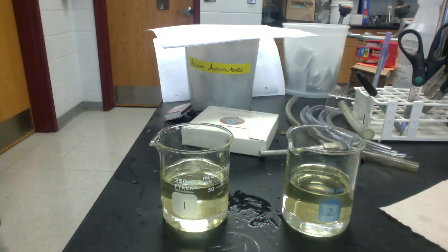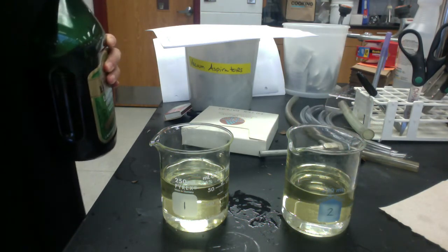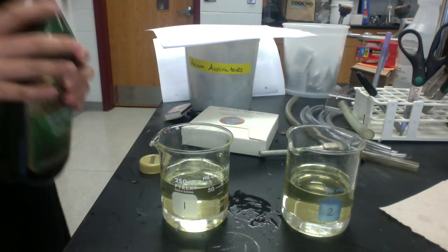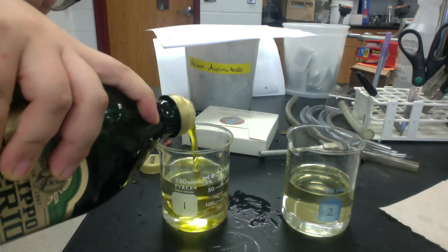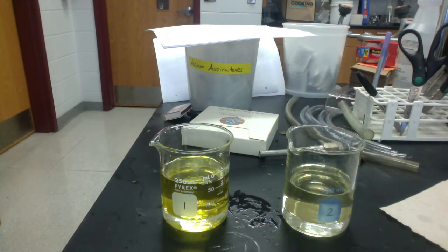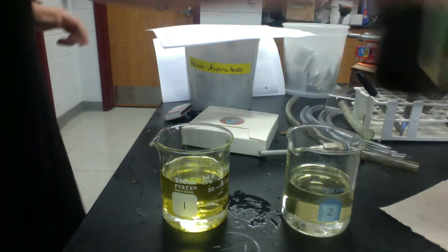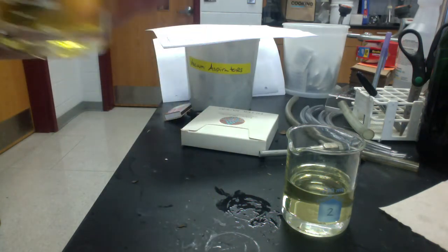Add a small amount of olive oil to beaker 1. So now it says to add a small amount of olive oil in the beaker. I don't know what a small amount means, but here I go. Interesting. Let's see where it settles out to.